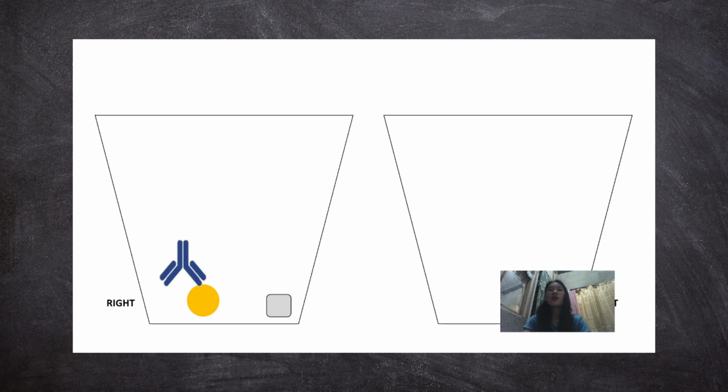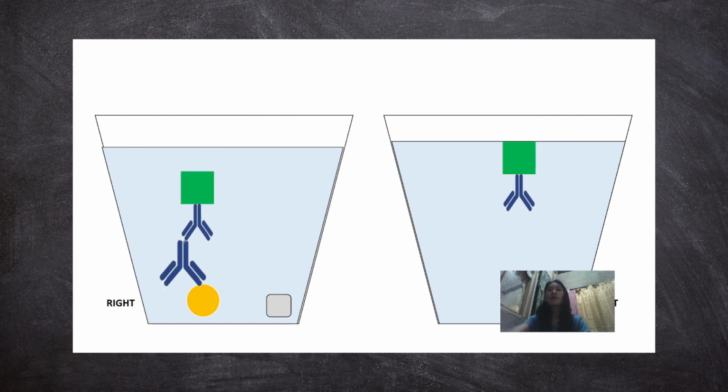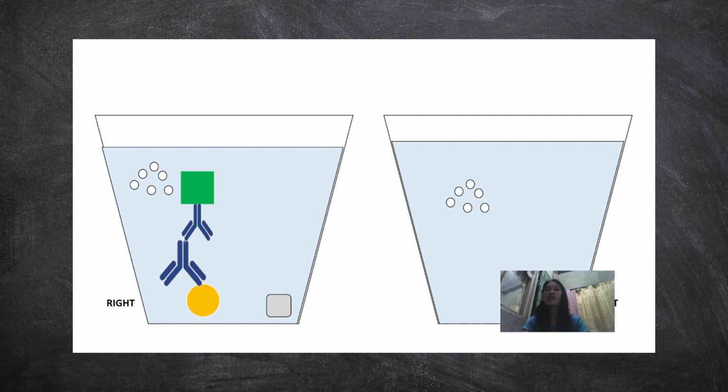Washing removes the antibody in the control, and a secondary antibody is given to each well that binds the remaining primary antibody. The washing steps remove the unbound antibody in the control. Now the wells are filled with solutions containing the substrate. The enzyme linked to the secondary antibody converts the substrate to a product which leads to a change of color. So again, the intensity can be detected through spectrometry. And that would be all.